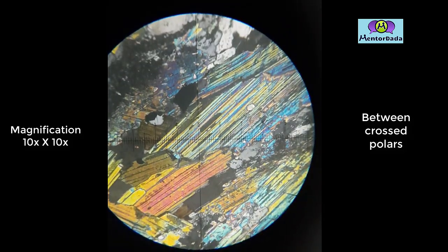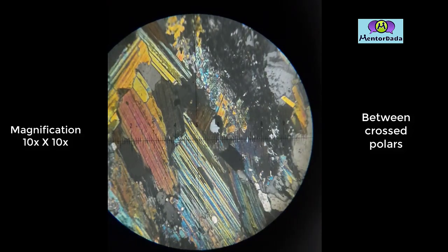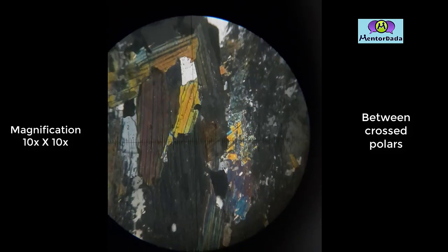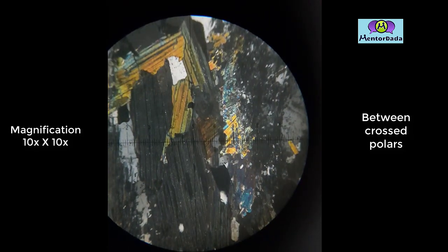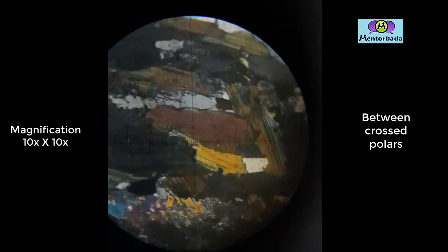Twinning has not been found. So from all these properties under plane polarized light and between cross polars, we can conclude that the mineral is muscovite.